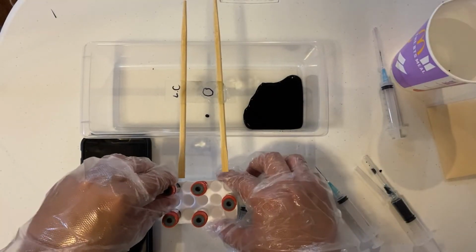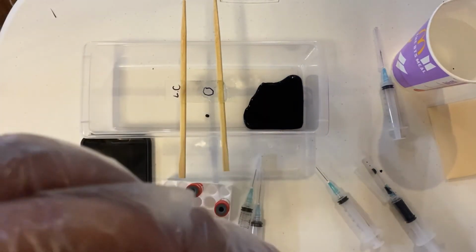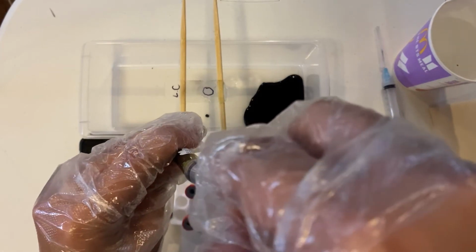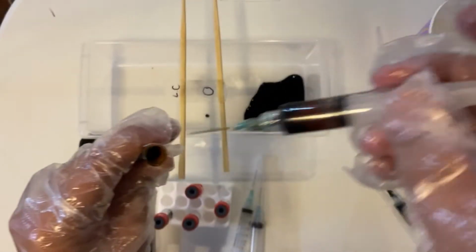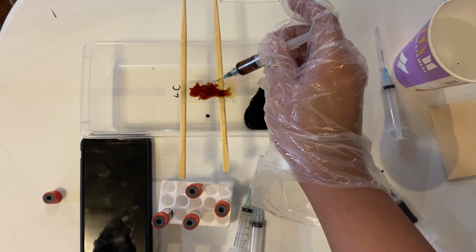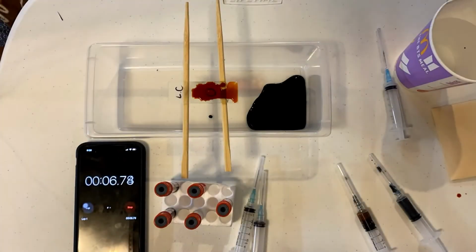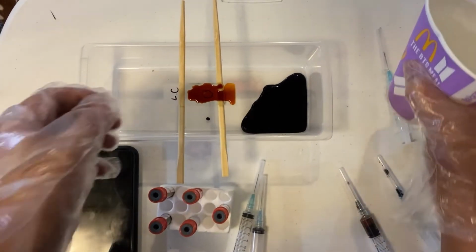Next, we will use a gram iodine stain. The stain will last for 30 seconds. Then, we will wash it again with distilled water.